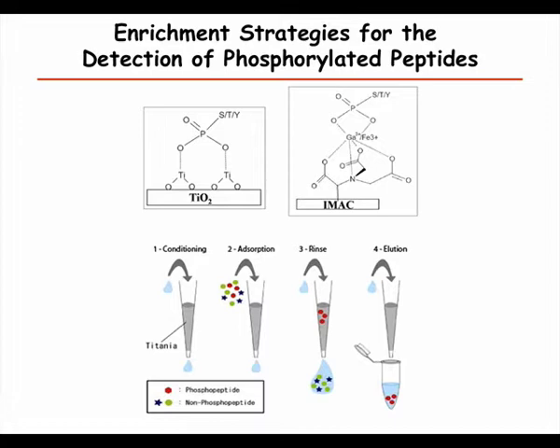So if we don't enrich for phosphopeptides, we don't see many of them.